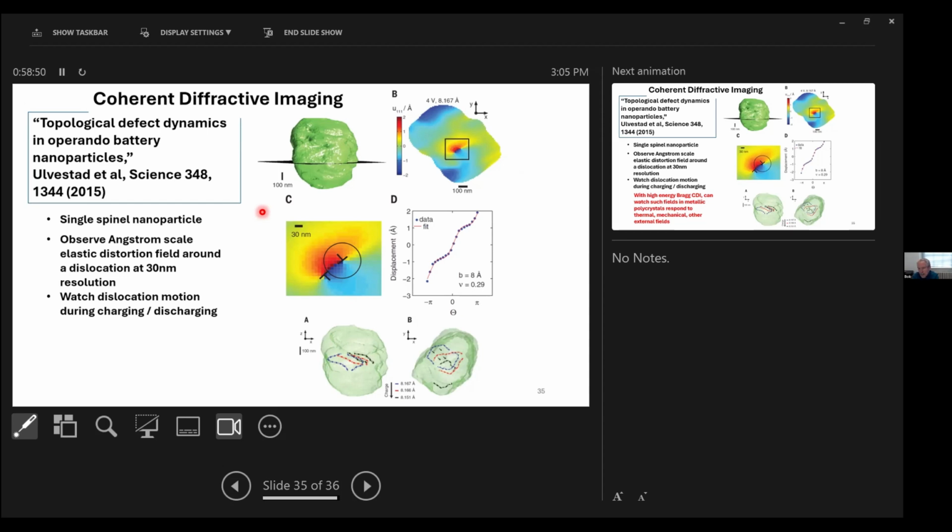So by doing that, we can identify positions and orientations of grains that could then be looked at with BCDI. And that was our motivation for doing that measurement. I don't have the result out yet, but I'm confident that we can get good center of mass positions, which will allow us to look at, for example, a polycrystal of nanocrystals, the polycrystalline nanocrystal array. Not without challenge, but I think we can actually do that kind of thing.